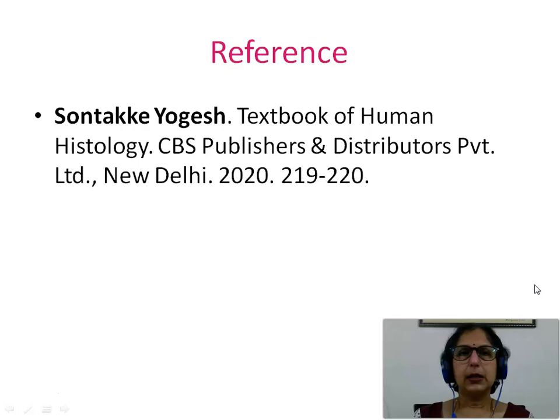Thus we have studied the important slide of histology of vermiform appendix in this video, and finally we also saw how to differentiate between the histology of small intestine and large intestine, how to differentiate between the two slides of large intestine, that is colon and vermiform appendix, and also how to differentiate between a slide of ileum and vermiform appendix.